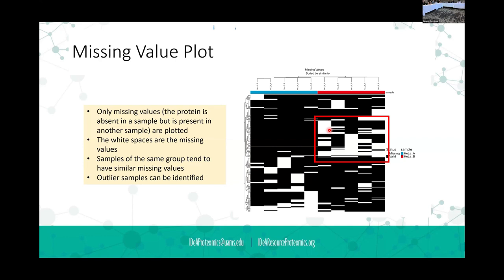And you've got to remember, I'm going to use my hands here. So for those of you that are by Zoom, you're not going to be able to see this, but we do all this chromatography to squish and concentrate the peptides together into a sharp, narrow peak. And so if we have a low level peptide, that peak can still be narrow, but it's really short. So if I use the top of my computer screen, when it's really concentrated, it's like this, but when it's really not concentrated, all you see is this little blip.